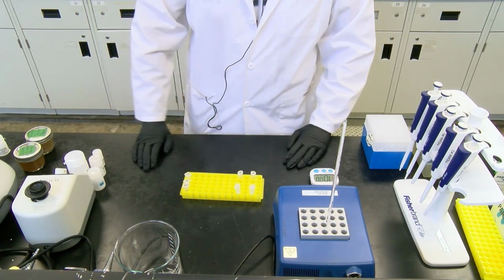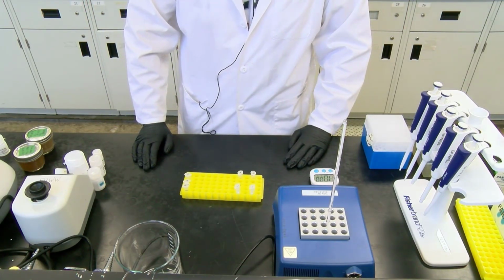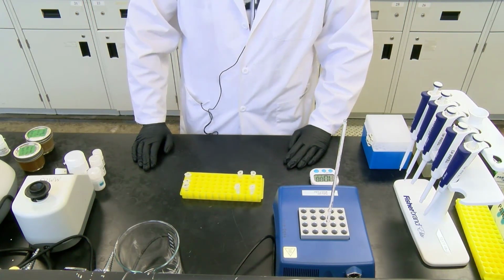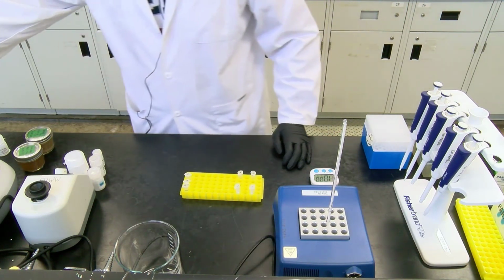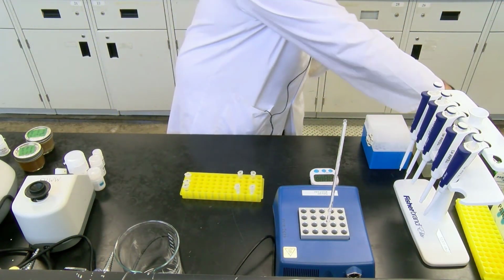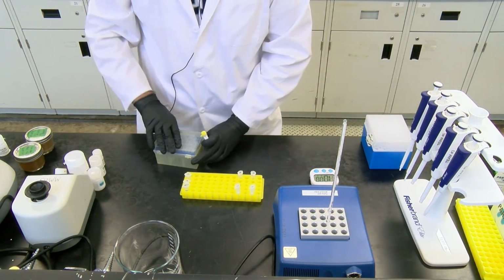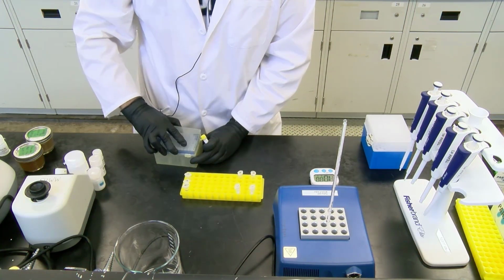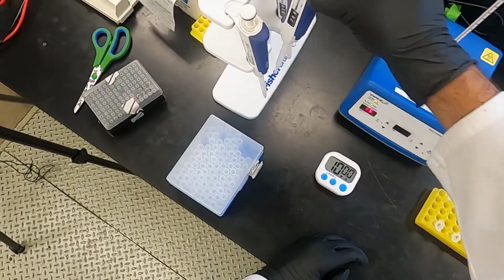Alright, so now that the timer is finished and we've waited the incubation period for the RNase, now we're going to add 20 microliters of proteinase K and 220 microliters of solution MS. So we're going to grab the proteinase K. This was also on ice. It's a good idea to keep yours on ice if you need it. We're going to grab pipettes.